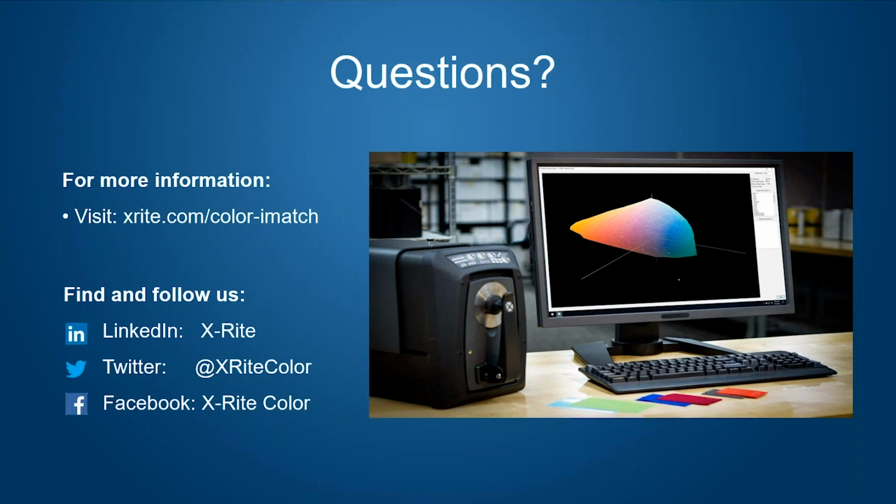I think there are a couple of things there. With translucent plastics, the way the software works is we have different measurement modes. For plastics, we can measure reflectance only, over light over dark, reflectance transmission, or transmission only. So in terms of translucency, it starts with the measurement. If we're trying to control translucency, we'd probably use a reflectance transmission measurement.